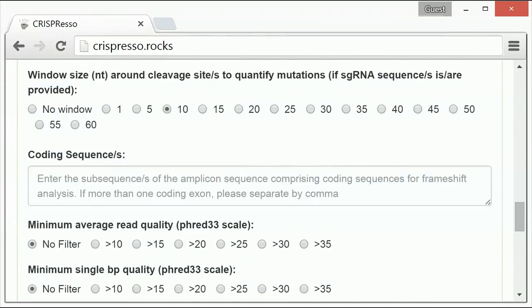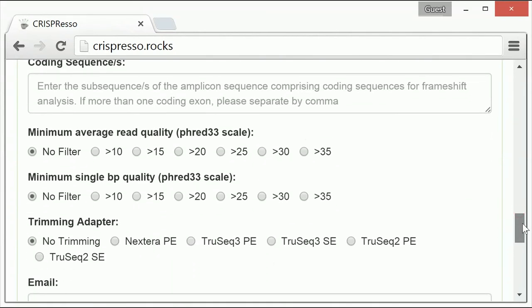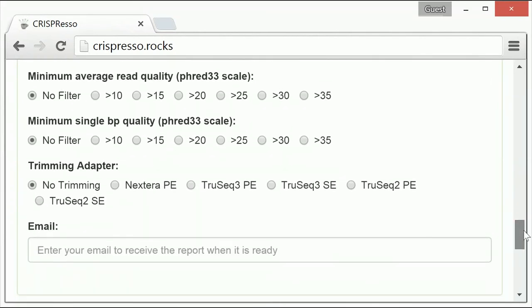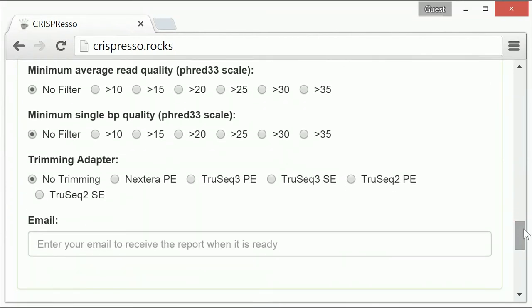The seventh and eighth optional parameters provide two options to filter reads according to sequencing data quality. The first is for filtering based on minimum average read quality, and the second is filtering based on minimum single base pair quality, both using the FRED 33 scale, which provides a quality score for deep sequencing data.